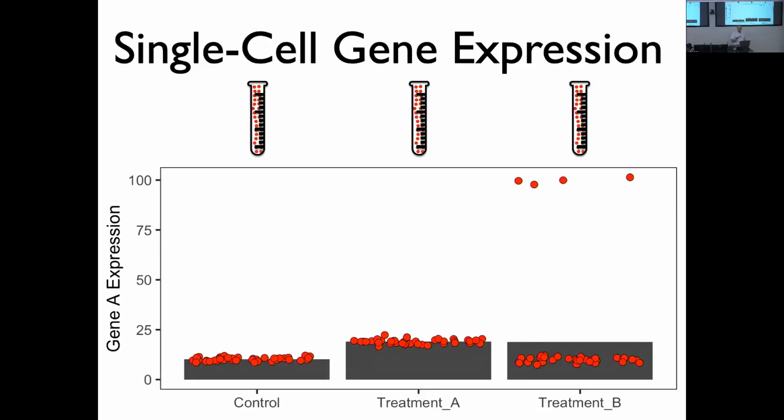And so these are obviously different, it looks like different biology. But if you are just looking at bulk RNA-seq, then you're going to miss this difference. So hopefully I've convinced you that there's some value in doing single cell RNA-seq. Later on, I'll try and convince you that you shouldn't waste your time.